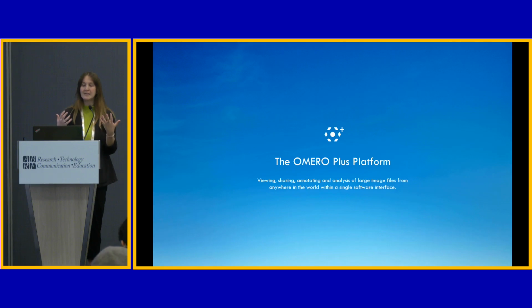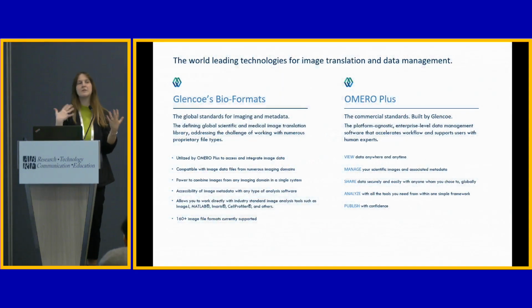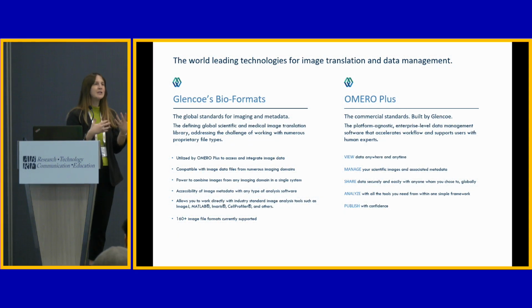So OMERO Plus is enabling that access from anywhere you are, so remote data access, and ideally within a single software interface. And I can't really explain the way that we're able to do that without defining this tool called Bio-Formats. So I mentioned that in bioimaging, many of you probably deal with this, there's a number of different proprietary file formats. So the microscope vendors are motivated to write data from the instrument as quickly as possible, and we're quite glad for this. But the outcome of that is that they're writing to often proprietary file formats that are not interoperable. And we want to be able to work with imaging data from across different domains and not just be stuck within a single vendor's platform.